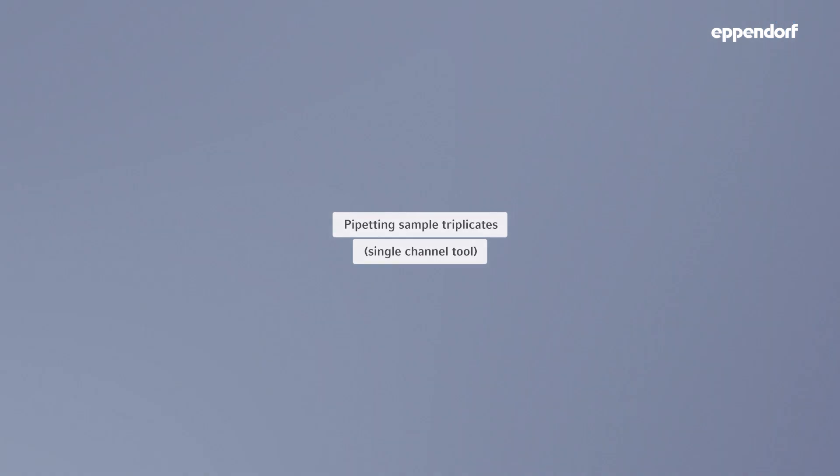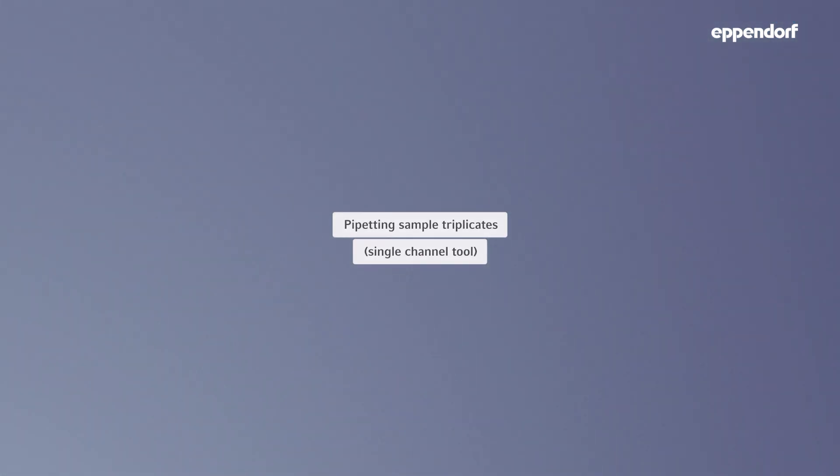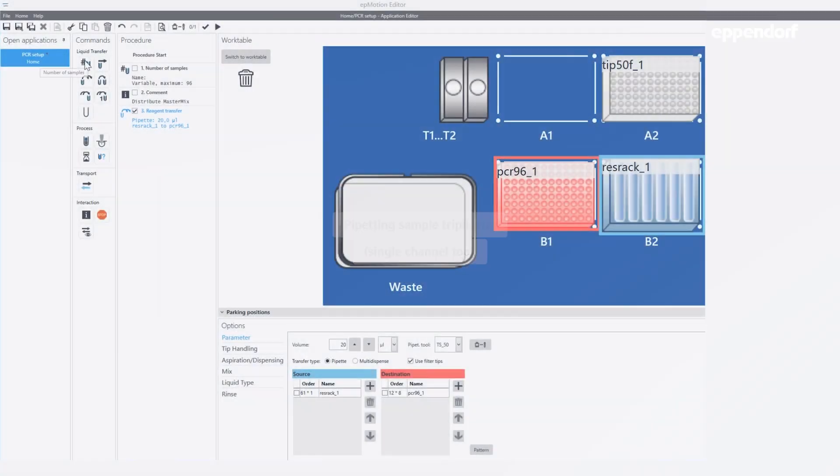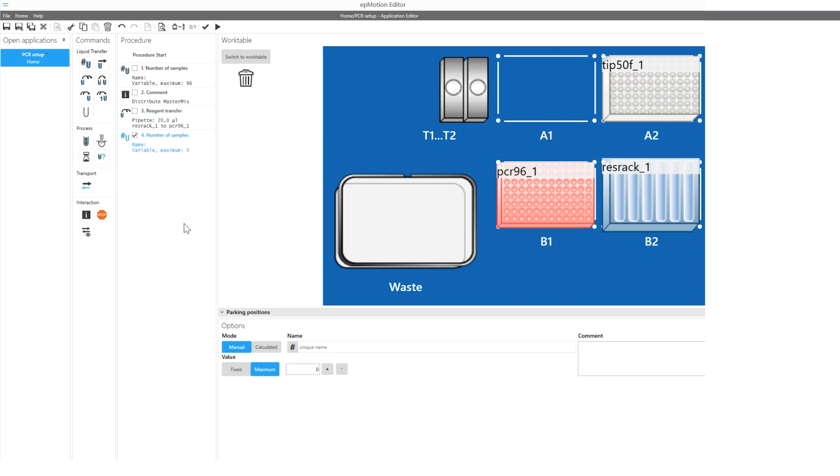In the next step, samples are added to the PCR master mix. Similar to the distribution of master mix, the number of samples command is used to define the number of samples you have for your PCR reaction.